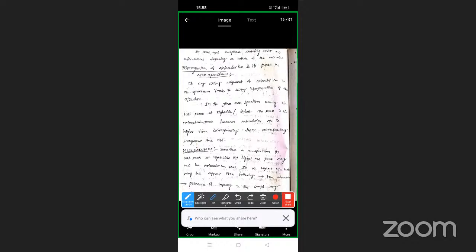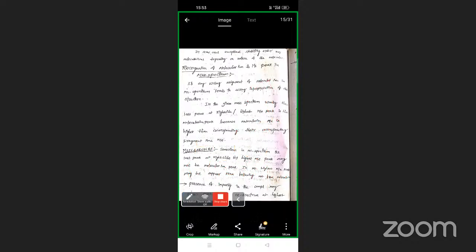Okay. For example, in this mass spectrum, all the lines are the fragment lines here, and for example here there are 78, 70, 74, 64, something 54. All these other values are their m/z values. On the x-axis we take the m/z values, and on the y-axis we take the percentage of relative abundance, or percent of natural abundance. For example, this is 78 here, so we consider this the molecular ion. This is your molecular ion. So in normal cases, in general, the last peak is the molecular ion.